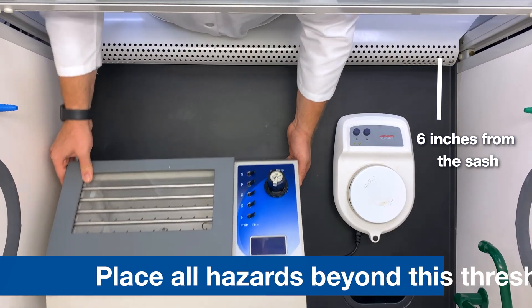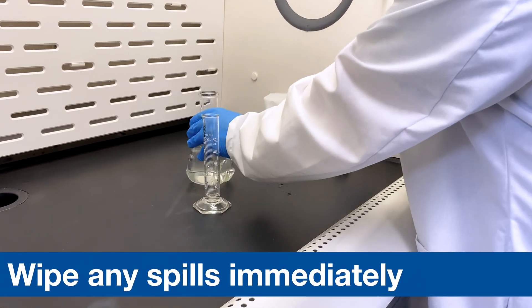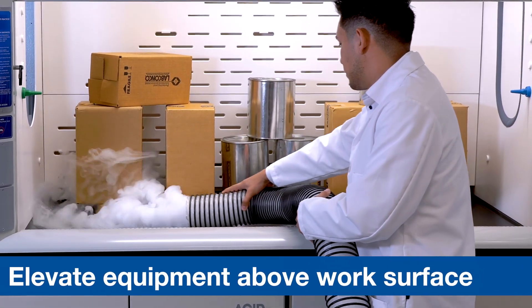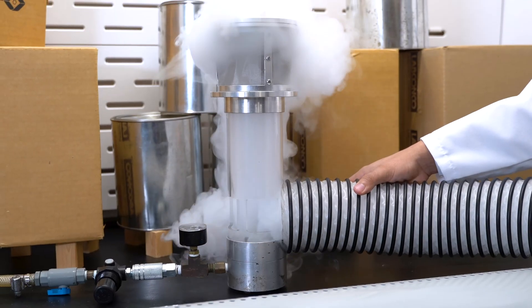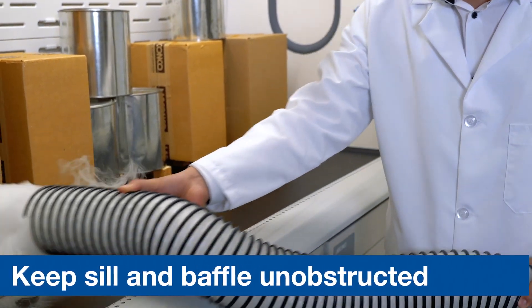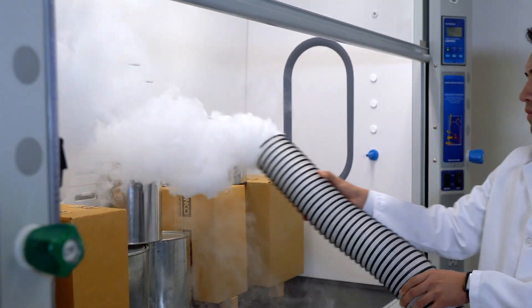Place all hazards beyond this threshold and be sure to wipe up any spills immediately. Elevate equipment above the work surface — equipment left flat on the work surface interferes with airflow needed below to efficiently clear contaminants. Keep the sill and baffle unobstructed. Obstructing these baffles can cause uneven face velocities and potential loss of containment.